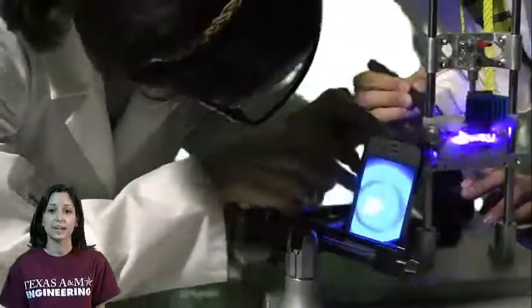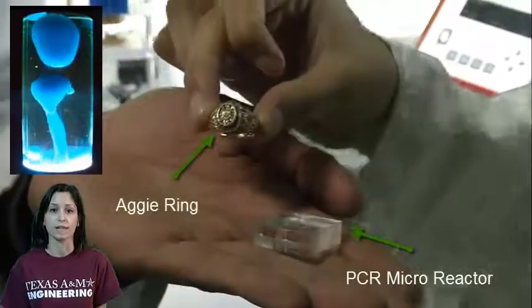Aggie engineers at Texas A&M University are doing just that, by developing a novel PCR system which works on the principle of lava lamps.